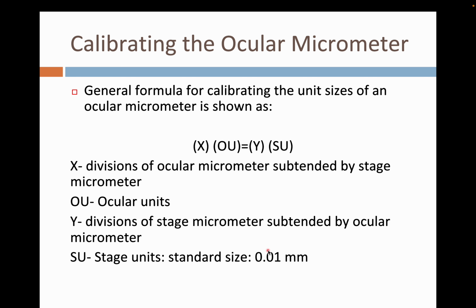In our laboratory proper, I will demonstrate how this formula is used. Part of your laboratory performance is to be able to calibrate ocular micrometers, so I won't really discuss more about that. You can do your own advanced reading. I will appreciate if you do your advanced study on how this formula can be utilized in calibrating ocular micrometers.